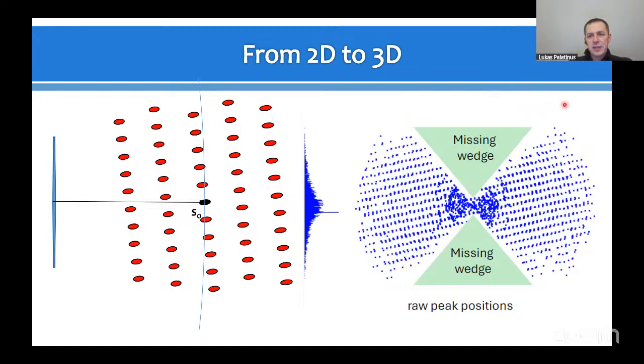Because we can't tilt the sample plus minus 90 degrees, well, in principle, maybe we even could in some microscopes, but because of the support of the crystal, the crystal gets shaded sooner or later, so it is not practically possible. There is always a so-called missing wedge, the area which we cannot reach on a single crystal in a typical instrument.